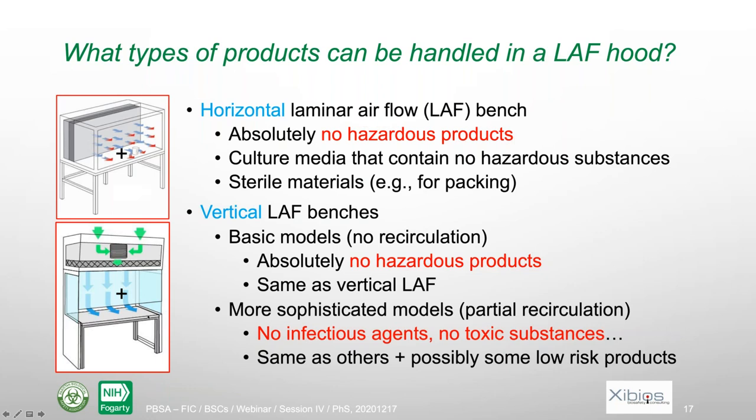Some of the more sophisticated models of vertical laminar flow benches, for instance, those with a front grill and a rear grill and a recycled part of the air, I would still not use for any infectious agent or toxic substances, but some possibly low risk products could still be handled there, because most of the air will be recycled and trapped in the HEPA filter. But there will still be something coming out, and so there is still a risk. So I will really limit it to low risk products.